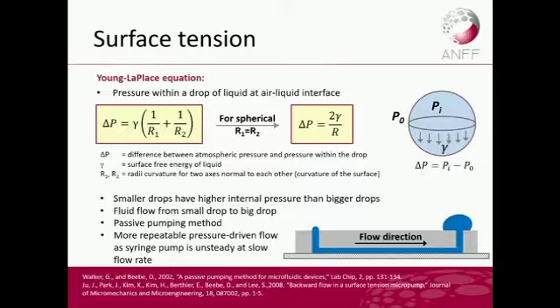And so it's quite useful in microfluidics because you can connect the two droplets via a channel and you get the drawing effect where the flow is going from the small droplet to the big droplet. So in effect, you're creating a passive pumping system. Now, this is passive in the sense that you don't have any mechanism on top of that.